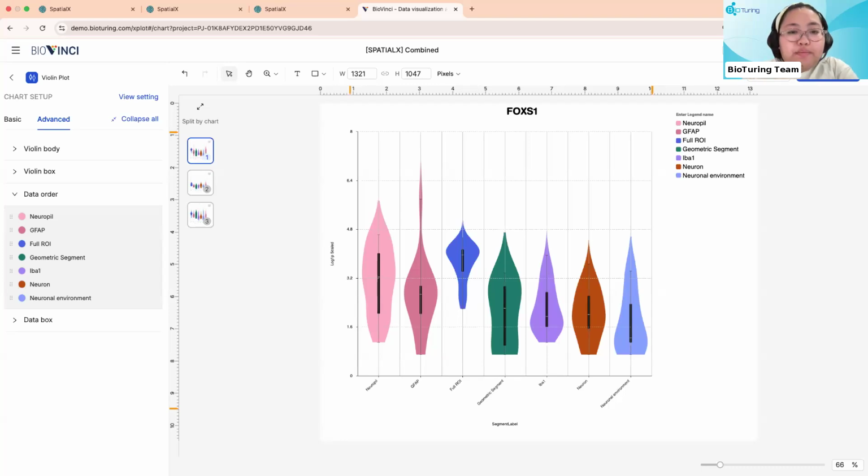Oh, we have one question from Showtime here. Is it possible to compare multiple metadata combinations in DGE, cluster 1 of sample A versus cluster 1 of sample B? Oh, yes, you can do that. So there are two ways to do that actually.